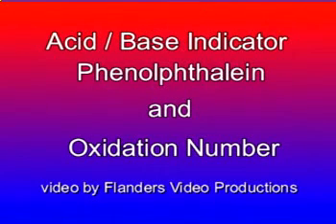In this demonstration, we're mixing two effects. The first is the effect of the acid-base indicator phenolphthalein. Now, you've learned about acid-base indicators already in Module 10. The second effect is the effect of oxidation number, which is what we're studying right now.